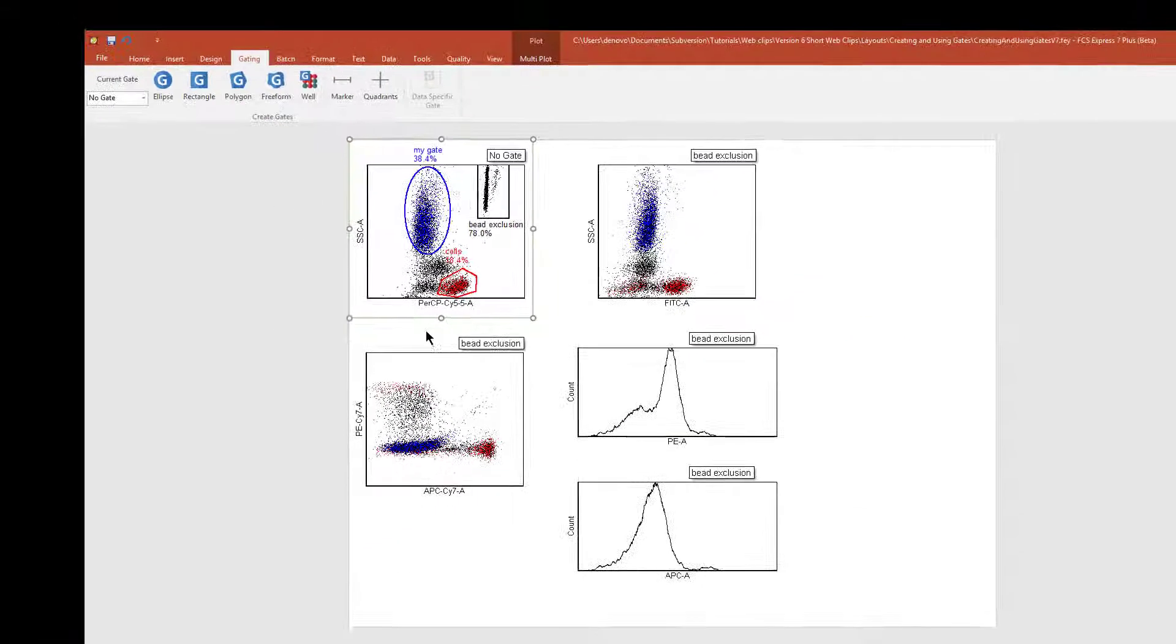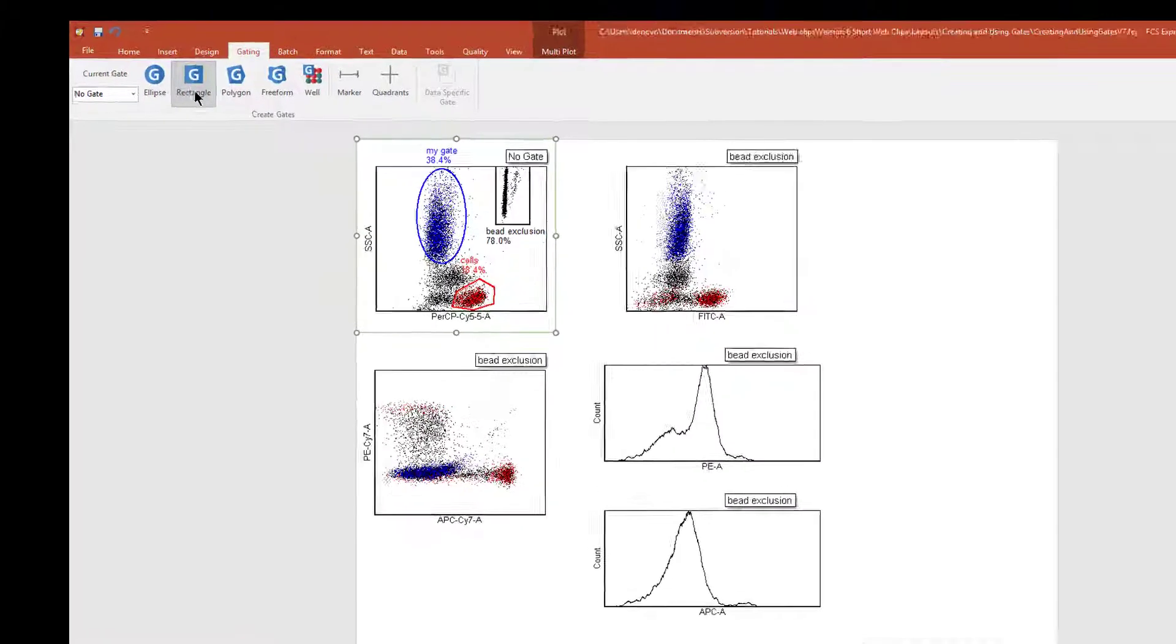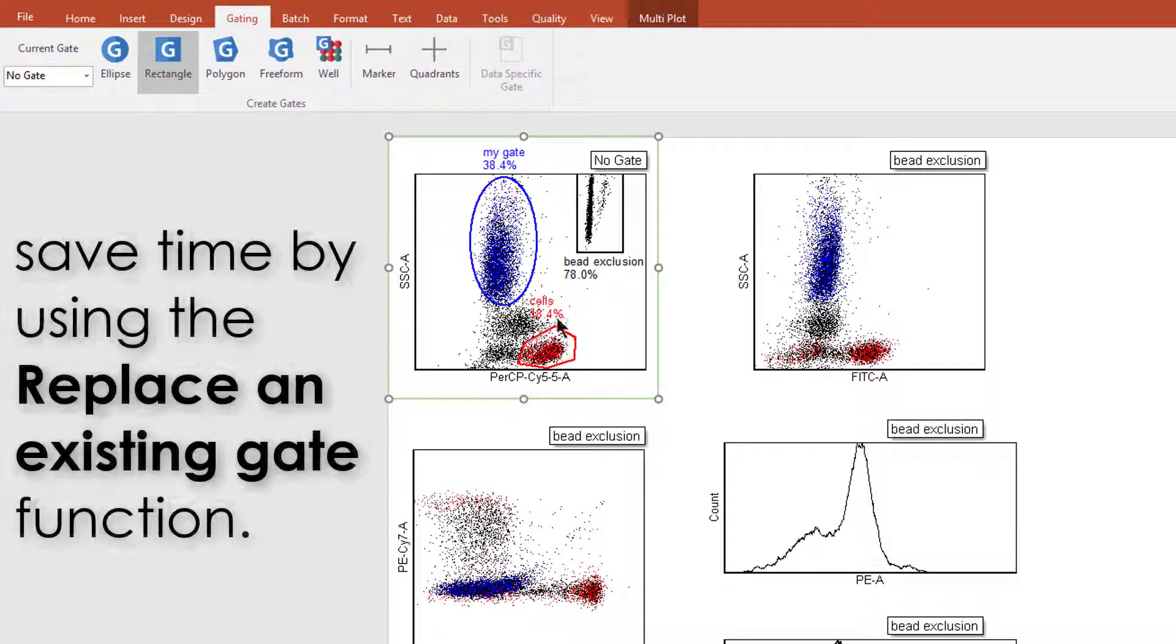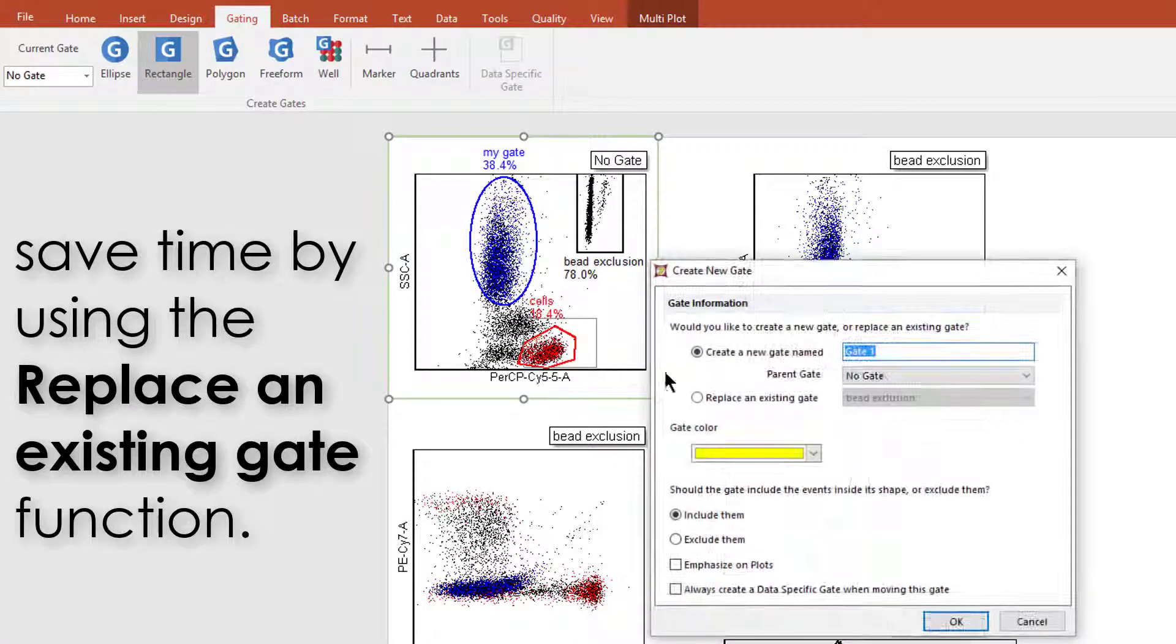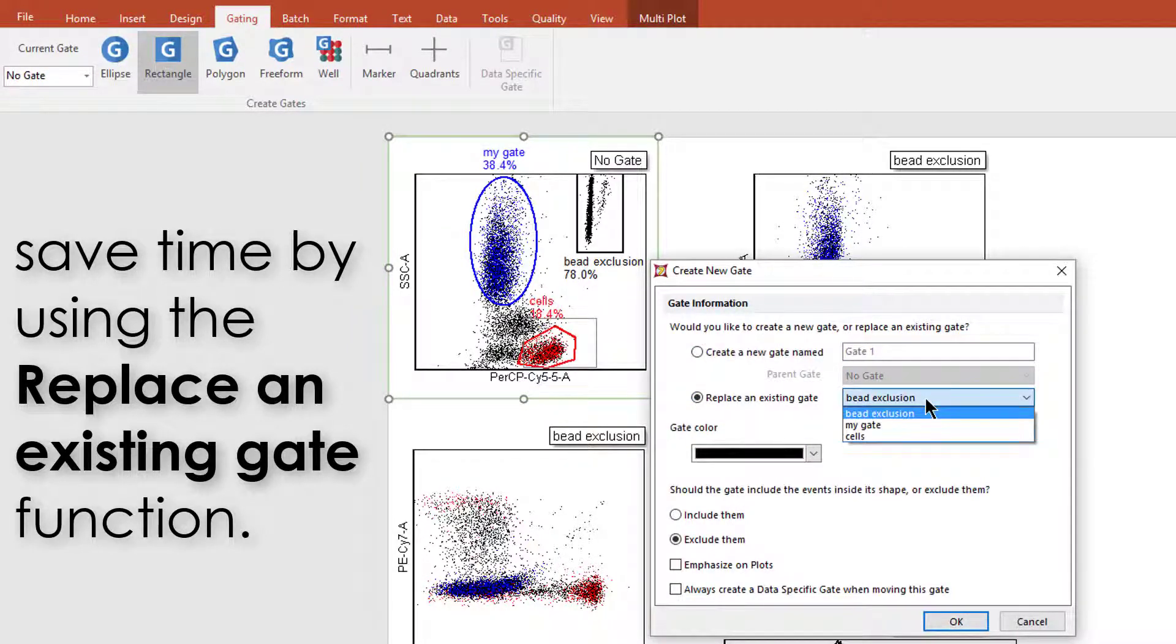If you wish to replace a gate, you don't need to start over. Just choose the gate type that you want to replace it with and draw it on your plot. Then, in the pop-up menu, select the gate that you want to replace.